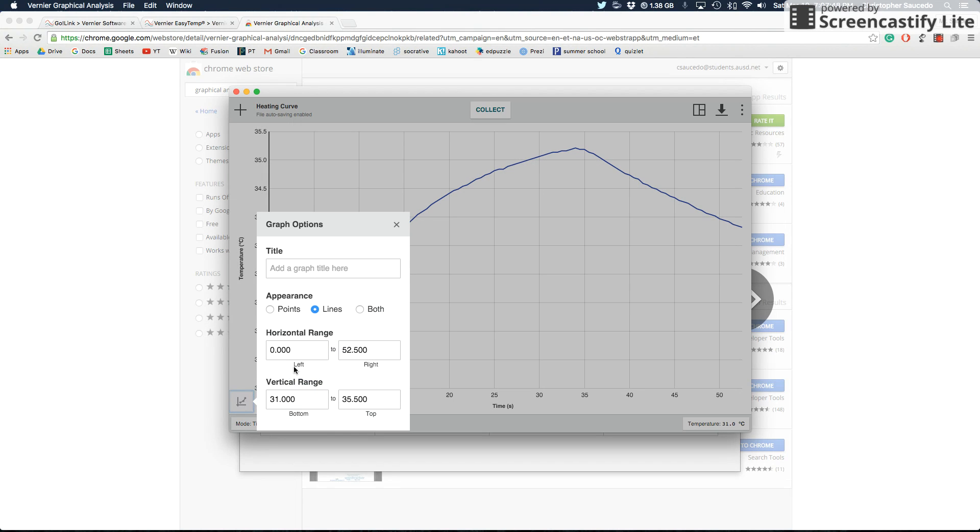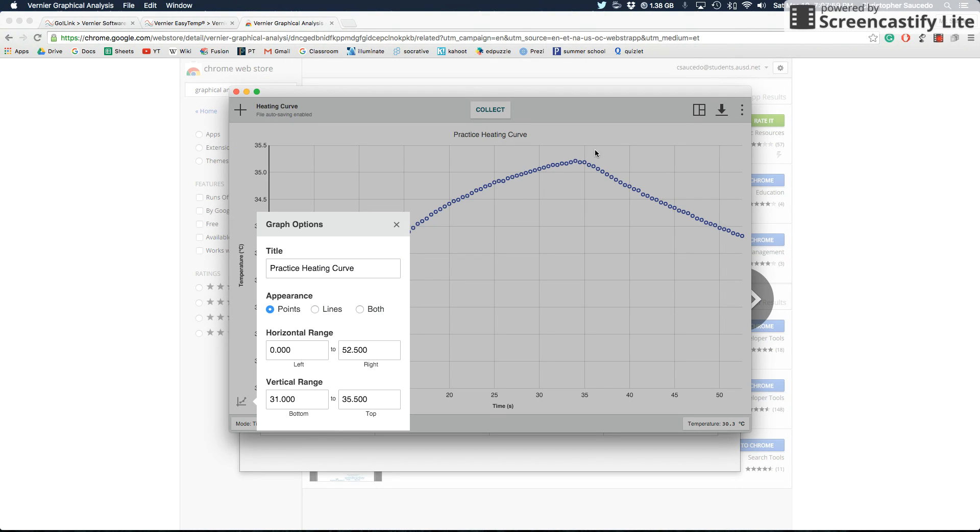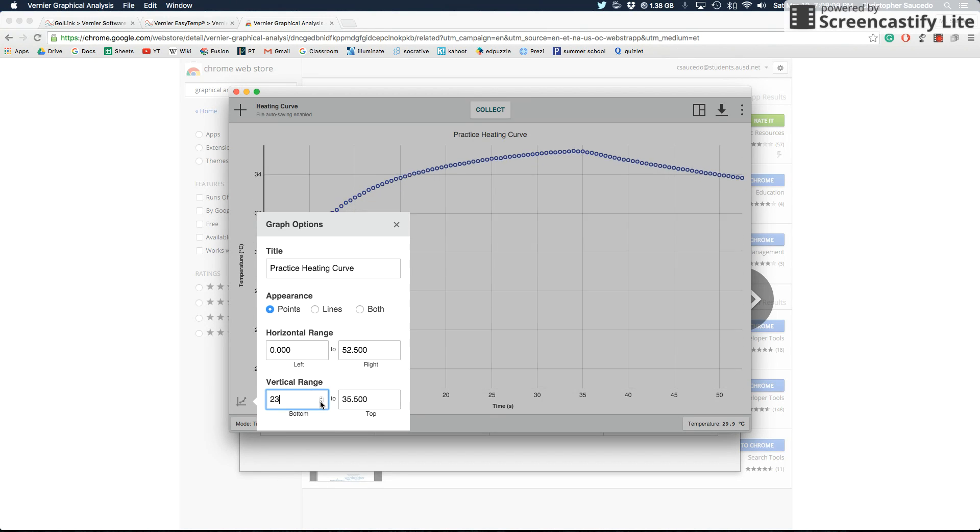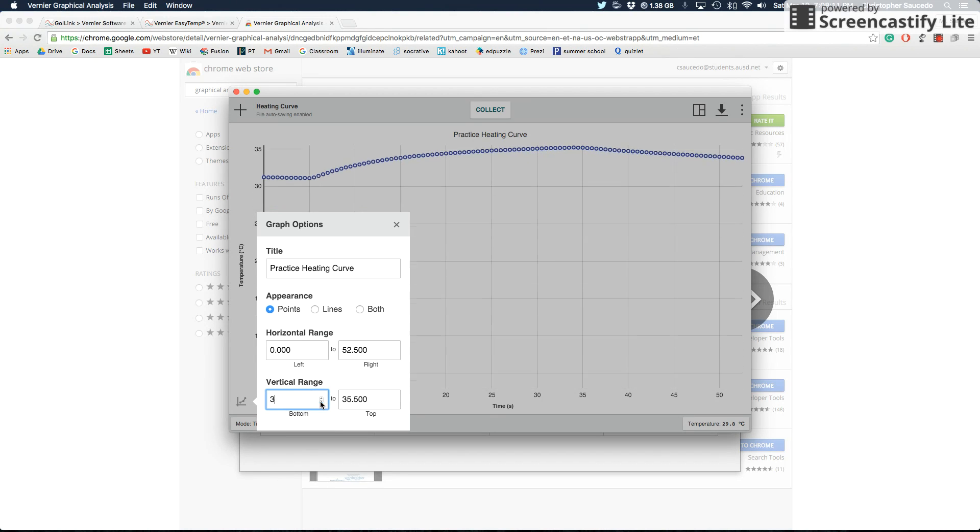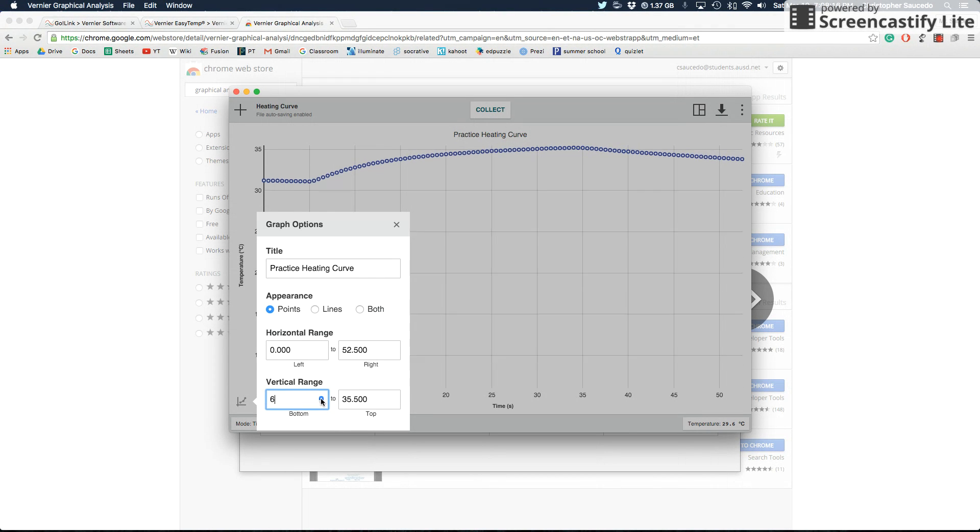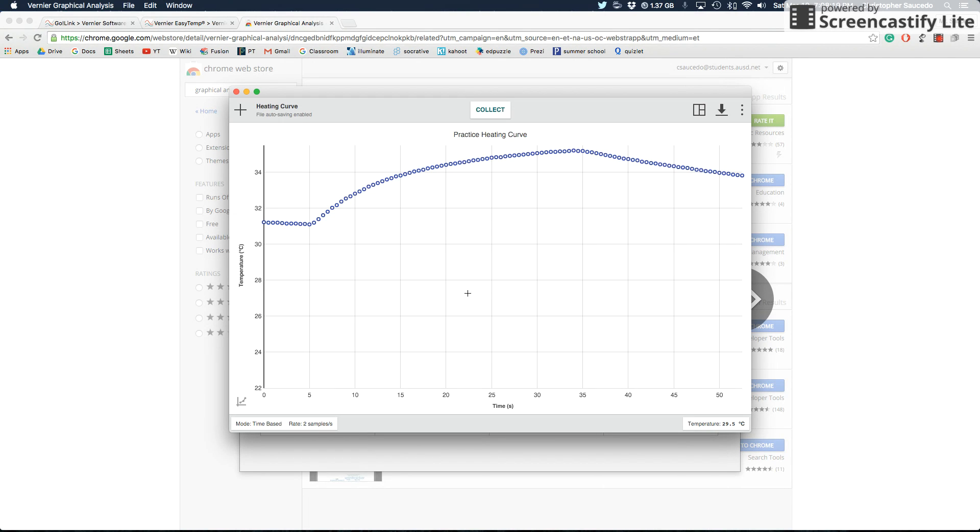Graph options is also kind of cool. You can give this a title. So for this, let's say, practice heating curve. You can have it change this to points instead of a line. And then here you can set the horizontal range and the vertical range as well. If you want that to be zero, you can move it all the way down to zero. If you try typing numbers in here, sometimes it goes a little crazy. So you might want to play around with that before you actually do something that might make your graph look even weirder.